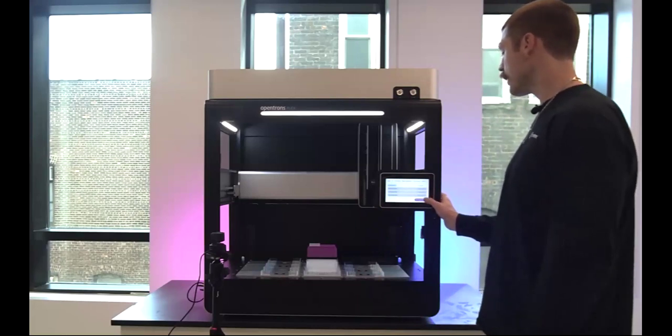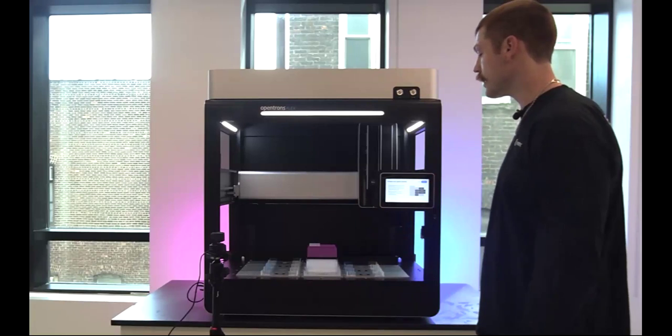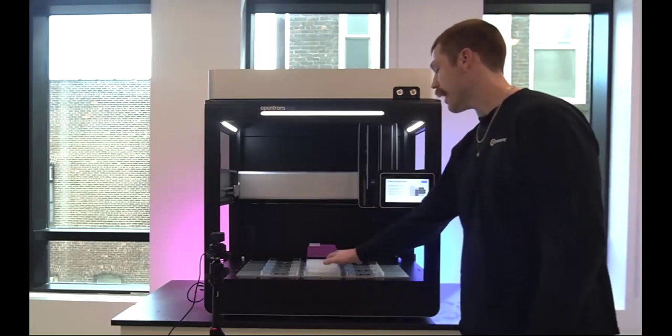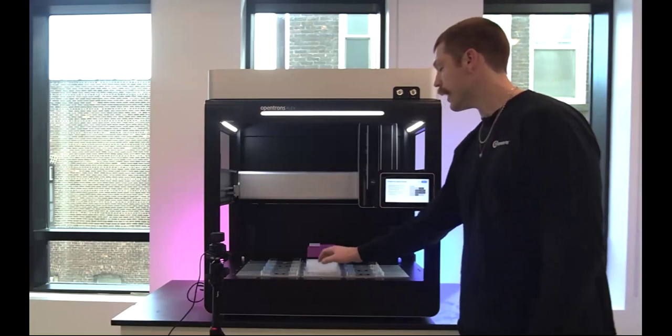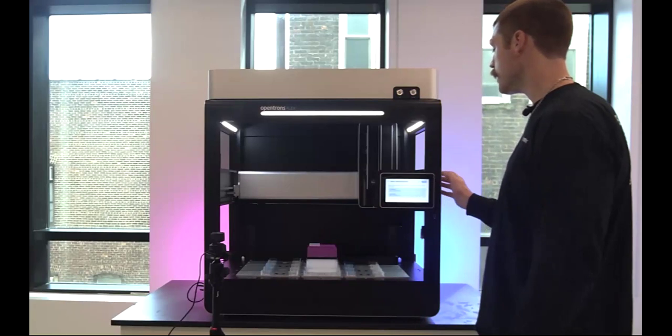Next, I'm going to quickly say, let's do a new quick transfer. There's going to be an overview of the requisite setup of this. I already have my robot set up in this configuration. So I have 50 microliter tips, a 96 deep well plate, and then a 96 PCR plate here. So I can continue through.